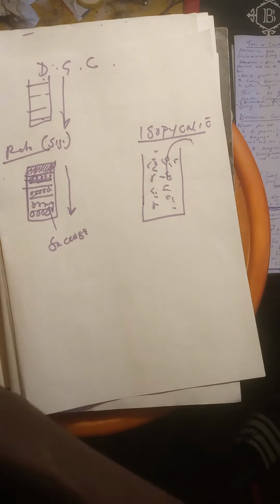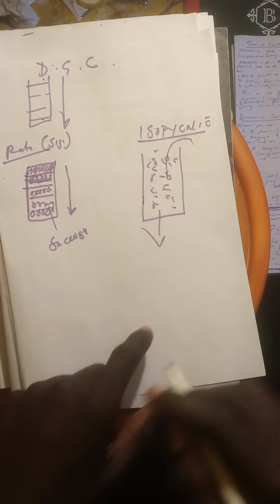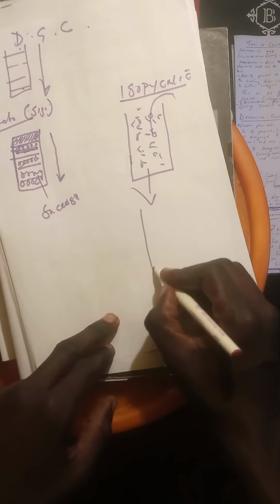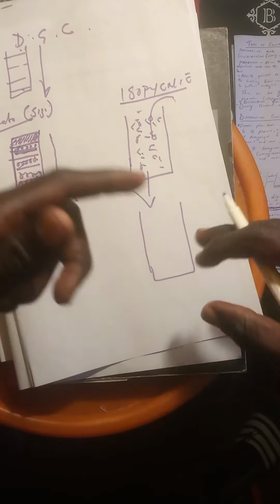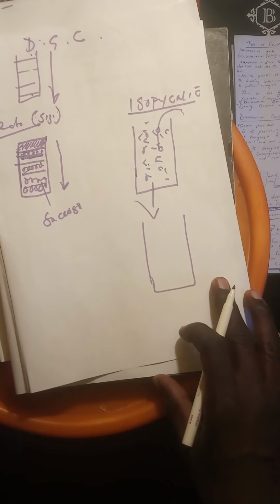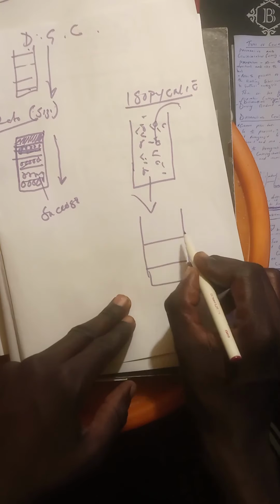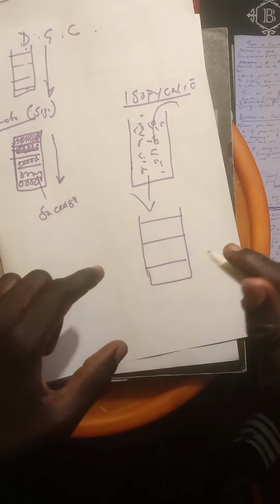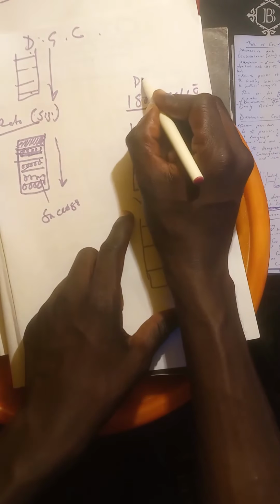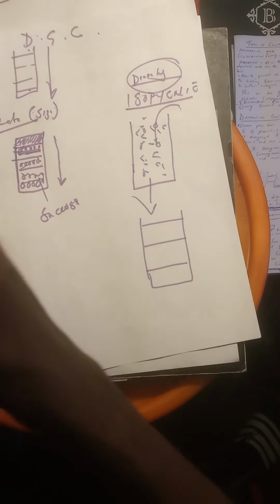Then you subject it to centrifugation, and the end result will be that the selected medium that you had chosen, when the centrifugation process takes place, forms zones of densities. And then the separation in this isopycnic is entirely based on density. So size is not to be considered.